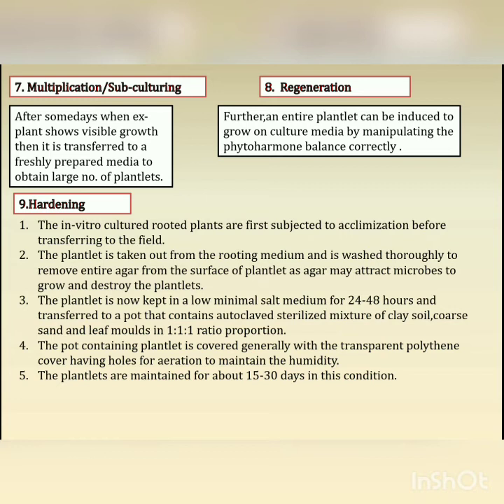Pot trays are like the ice trays you can see in your fridges, in which we can put the soil mixtures, and then we can make small holes so that the plantlets can fix in them, and we put the plantlets there.